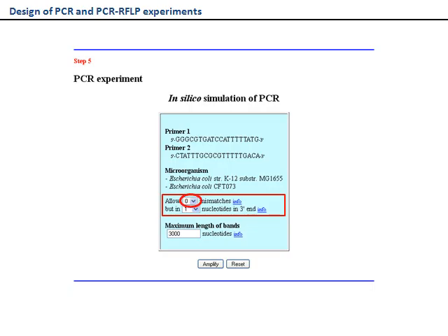Up to 2 mismatches are allowed by the simulation program, and mismatches may be limited in the 3' end. It is suggested that the instructor point out the importance of those limits and their relationship with stringency and PCR amplification. Finally, the maximum length of the amplified bands may be modified.